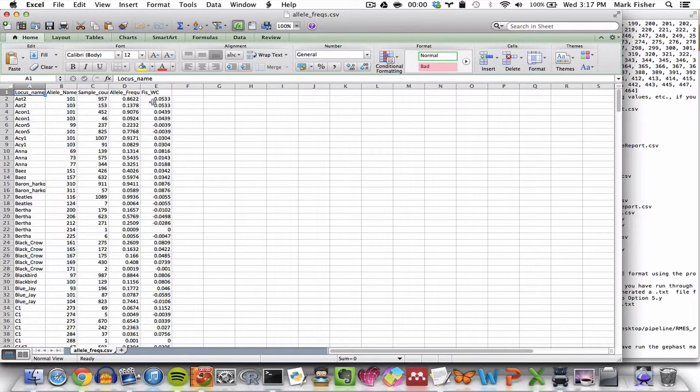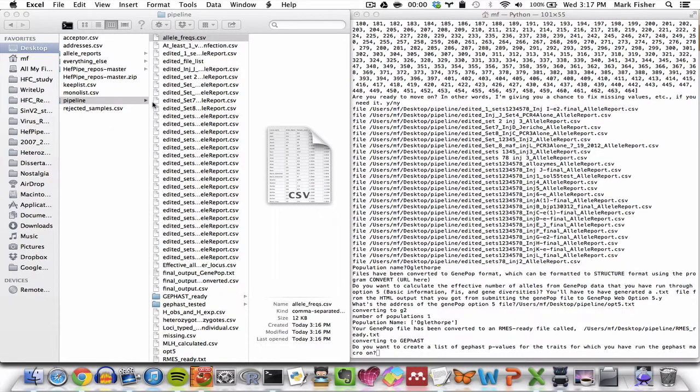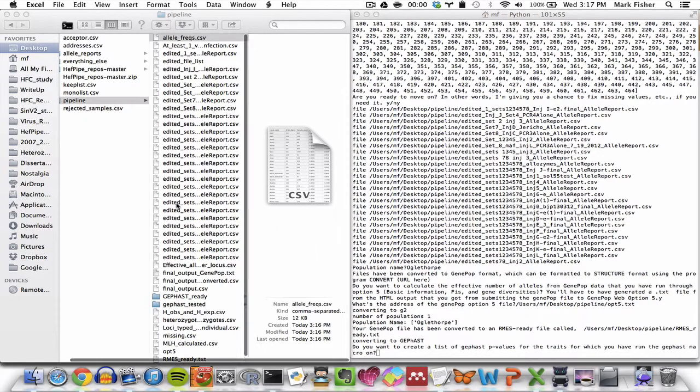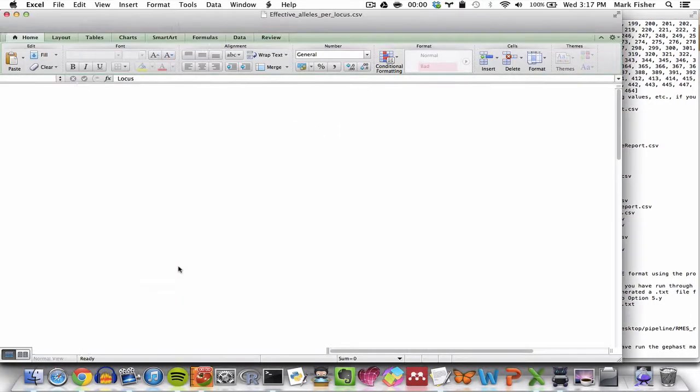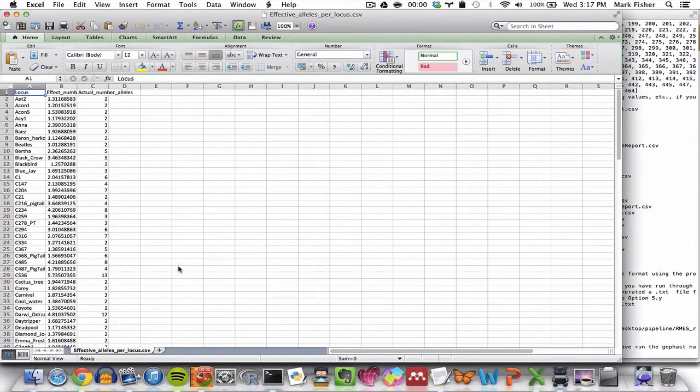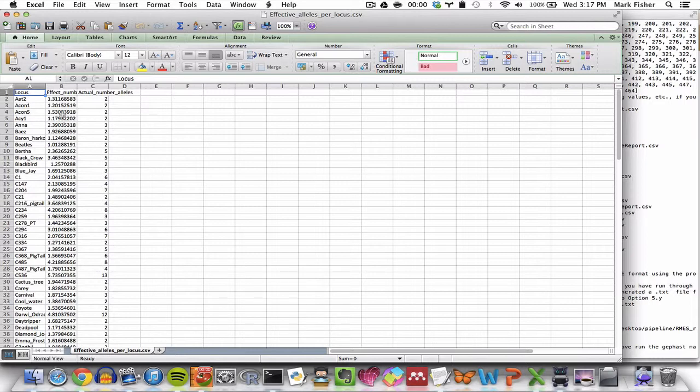It also generates a separate CSV file called effective alleles per locus, and that's here, which contains the actual number of alleles and the effective number of alleles for each locus. So here's the effective, and here's the actual number of alleles.